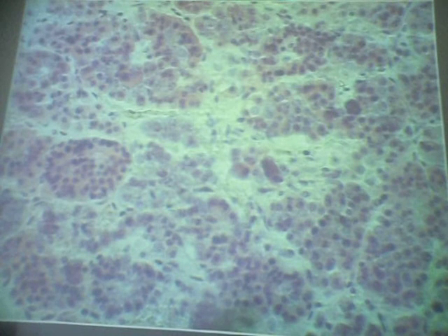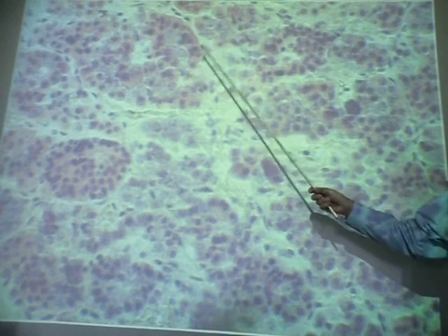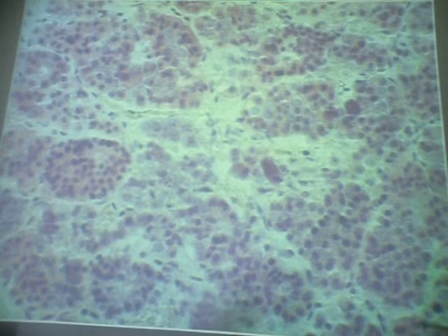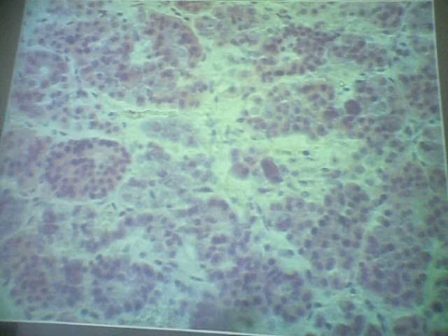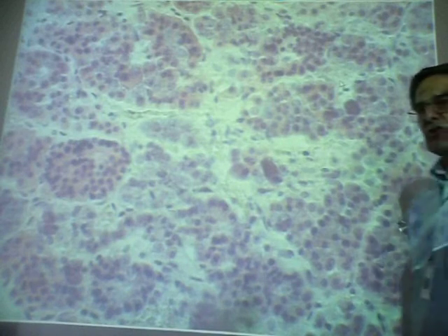And they produce, as you might expect, different hormones. So let's look first at the hormones produced by the acidophil cells, the ones with the pink cytoplasm. You can see on your hormone handout there, top of the first page, under pituitary where it says anterior pituitary, growth hormone is one, also called human growth hormone.